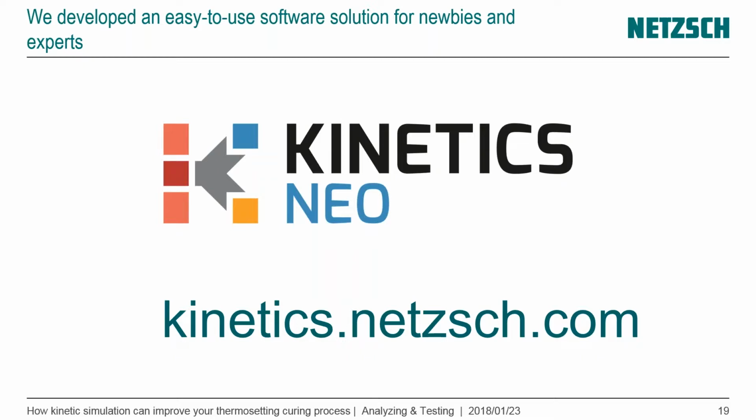Yes, we have these questions. We have these questions also for semi-crystalline thermoplastic materials. And in literature, for thermoplastic materials, you can find that the Avrami exponent is one magnitude that is often used for characterizing the nucleation rate. And this is something you can do with Kinetics NEO and with kinetic studies.